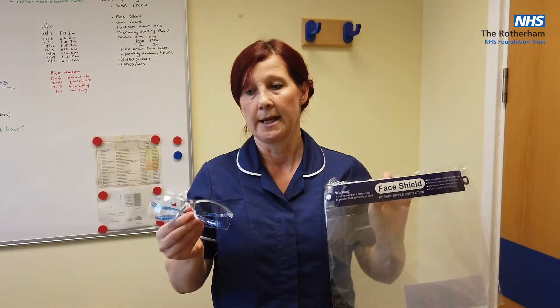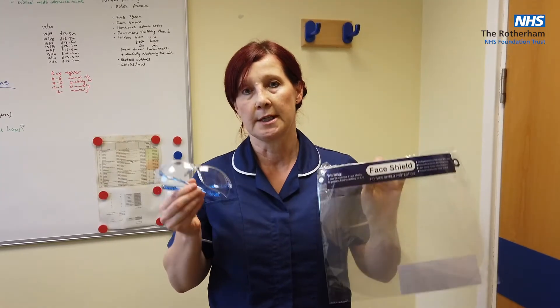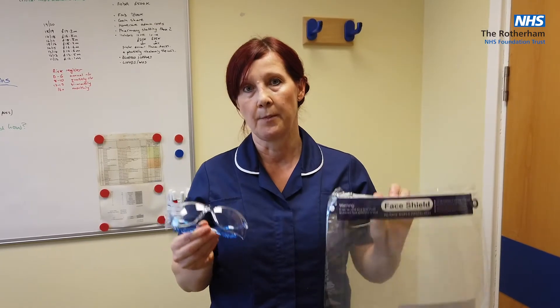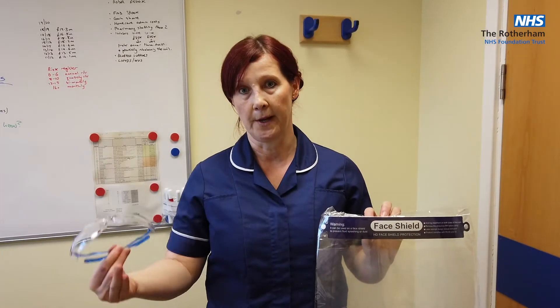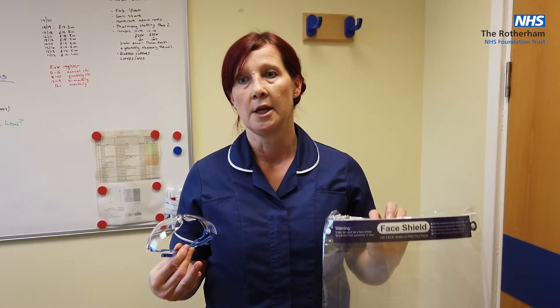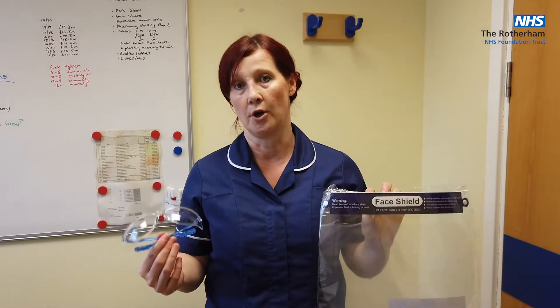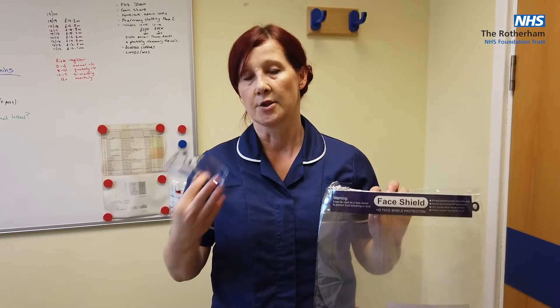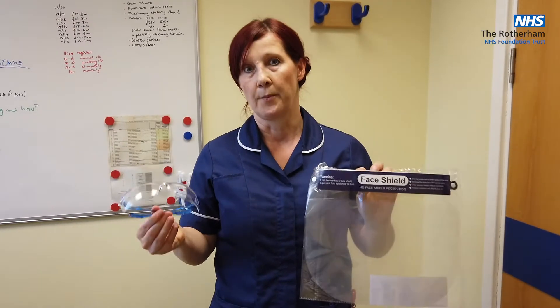You've now got your surgical mask in place and your eye protection in place. Going to deliver care within two metres of a patient, you would then don apron and gloves. If you are doing a face-to-face assessment with a patient but maintaining two metres social distancing, you can keep your sessional mask and eye protection on. Whenever you go in within two metres, actually delivering care in close proximity of a patient, you must don apron and gloves.